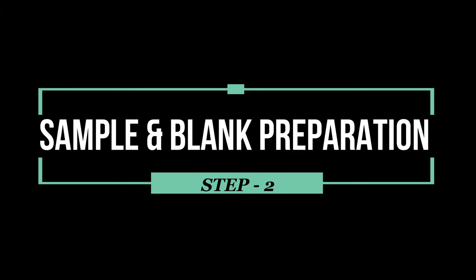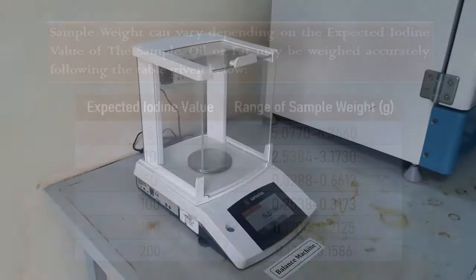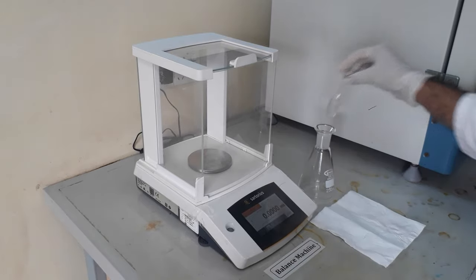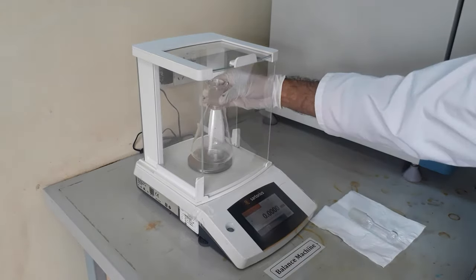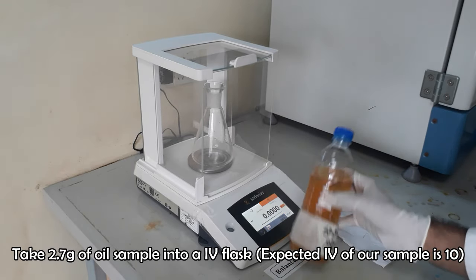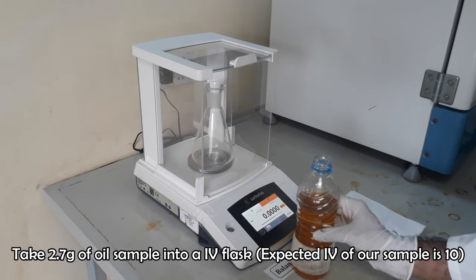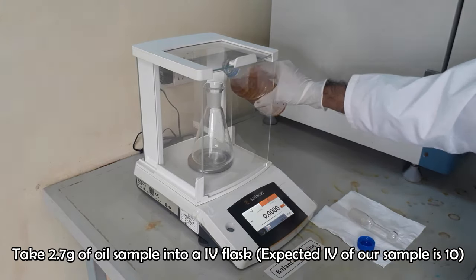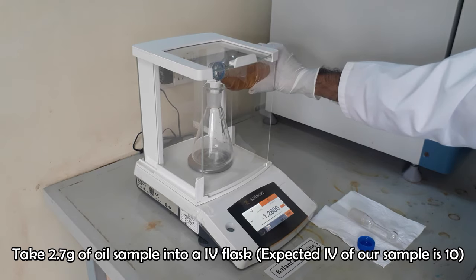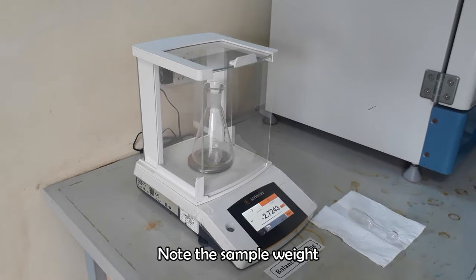Now we have to prepare our sample along with the blank. Sample weight varies depending on the expected iodine value. Take a certain amount of sample following the table shown on the screen. For this test, we will take 2.5 to 3.1 grams of oil sample in an IV flask, as the expected iodine value of our sample is 10. Note the sample weight.